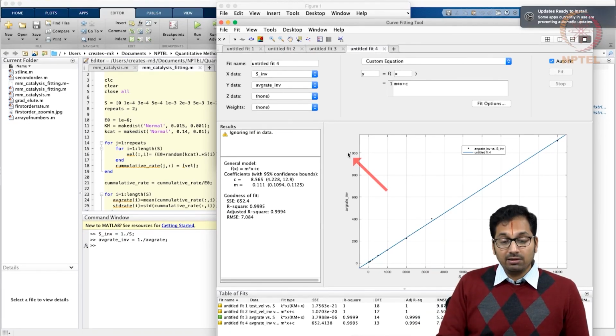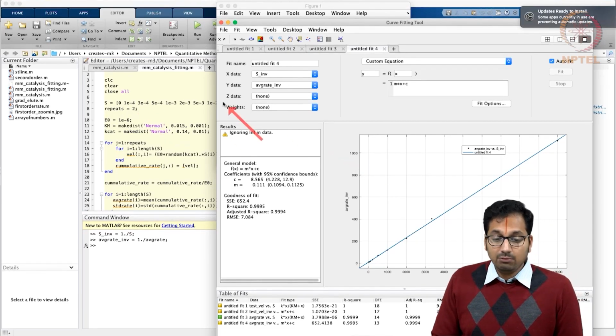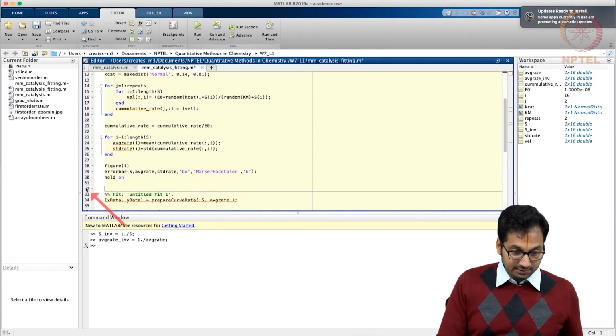Once again, I am showing the value of simulation. Hopefully in a later week we can do an experiment, get experimental data and fit it, and go forward with that fitting in MATLAB itself. So now what we can do is have the same 2 repeats, and the code that I had ended up muting, right now I will erase the if statements.